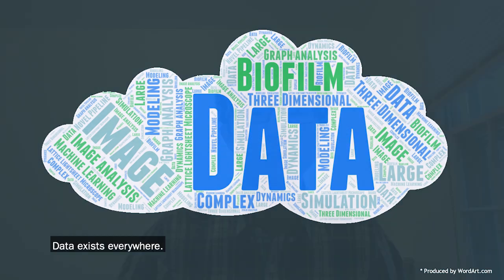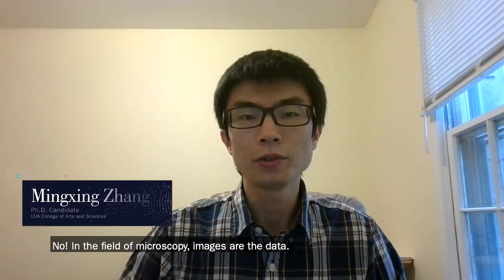Data exists everywhere. Is data limited to numbers and words? No. In the field of microscopy, images are the data. Today, we are going to show you a novel image analysis workflow to segment bacterial cells from 3D dense biofilm data.